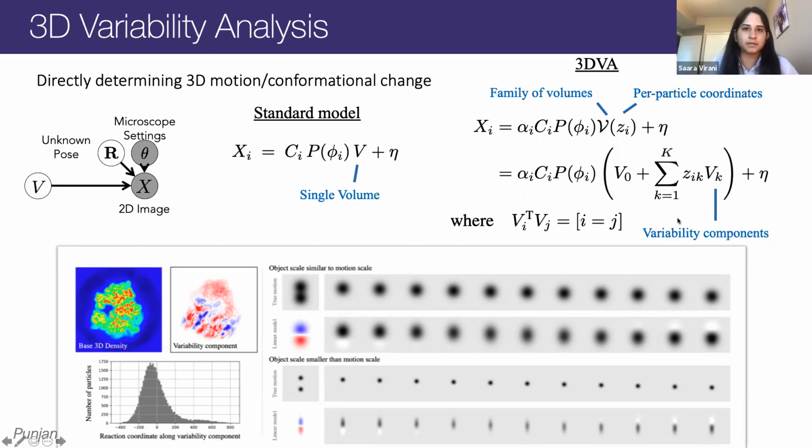And now, just to understand how 3D variability differs a little bit from other refinement and similar conformational heterogeneity exploratory approaches: the first question is, would the continuous 3D variability algorithm produce similar results as multi-body refinement and other software like RELION, for example? That's a great question. Yes and no.